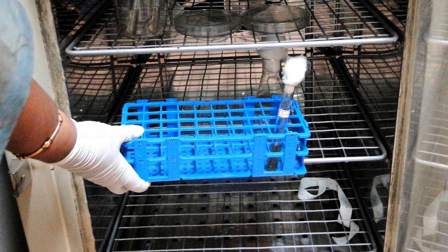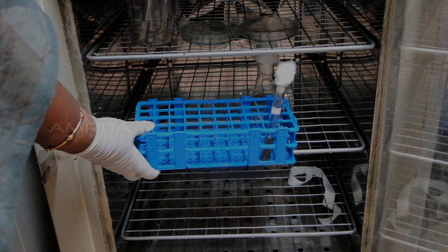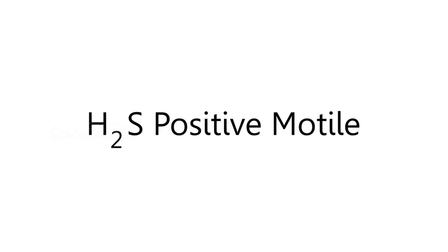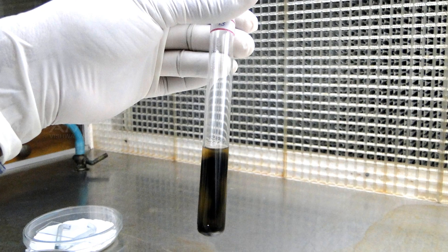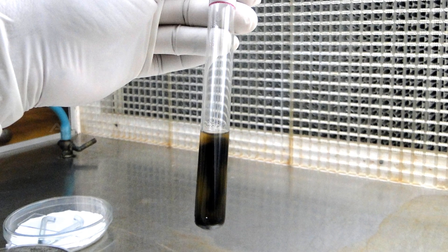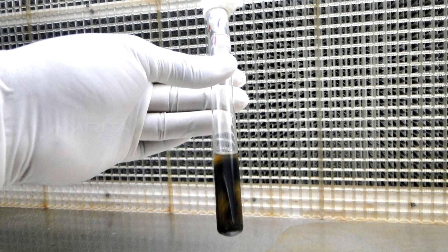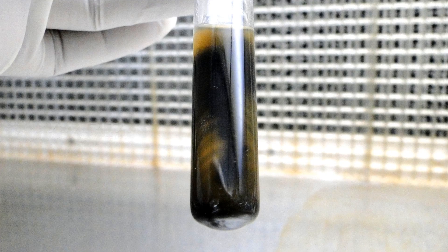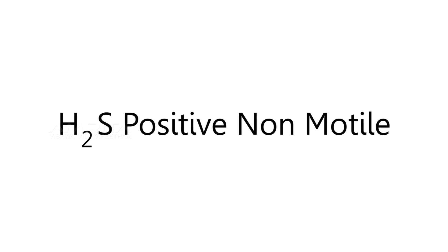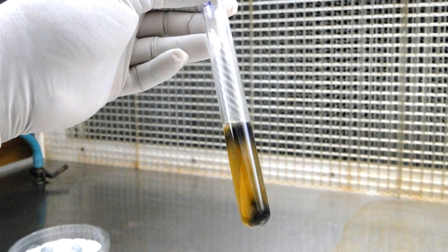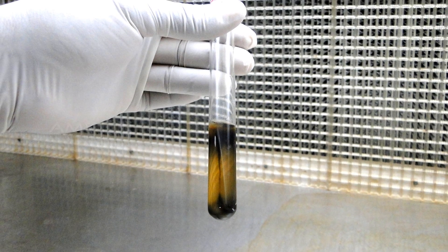After 24 hours, take out the tubes and observe the possible results. The result shows dispersed growth of the organism outward from the stab line, indicating that the organism is actively motile. Black coloration in the medium is indicative of sulphur reduction and hydrogen sulphide production by the organism.